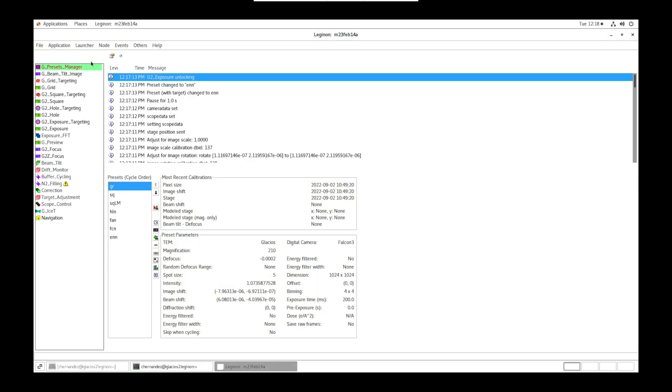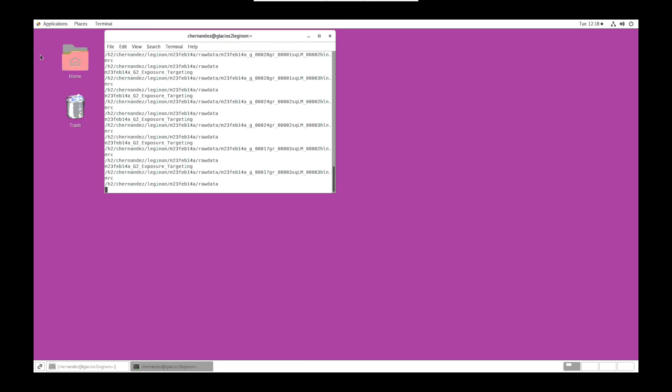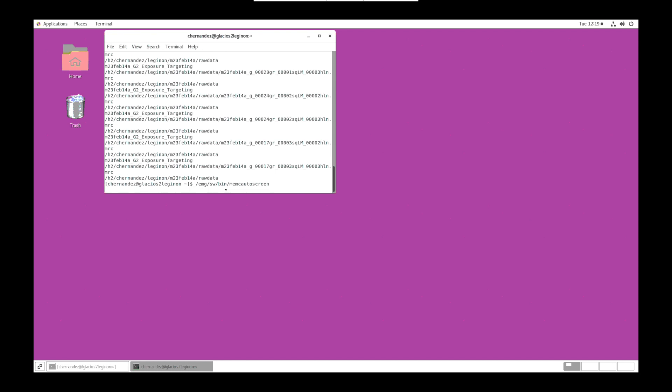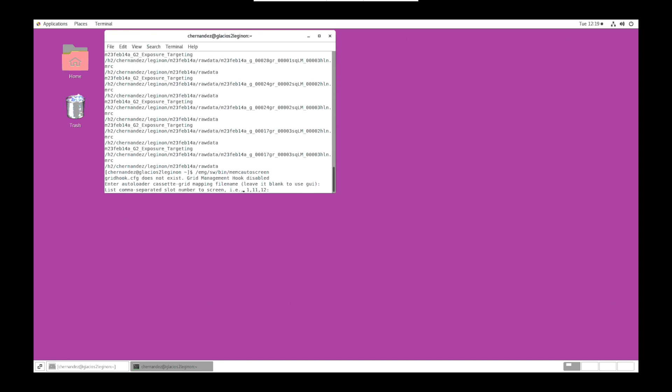Once complete, go to application, kill, file, exit. Back in terminal, type slash emg slash sw slash bin slash nccat or memc auto screen depending on which center you are utilizing. We can hit enter to use the GUI.